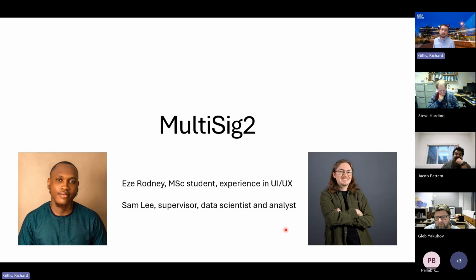He said, we don't have the funding, so what we'll do is we will get a master's student, Rodney, to code it up for you, and we'll use it as part of his MSc dissertation. So we have been running a master's dissertation where I am the client and Rodney is the developer, and he has been developing some software for me.